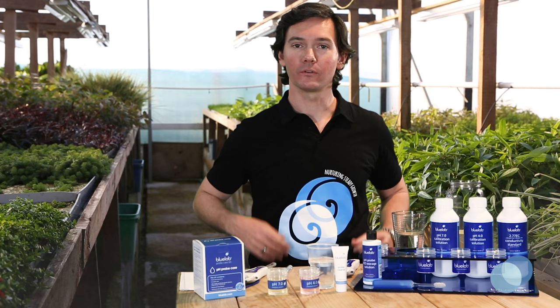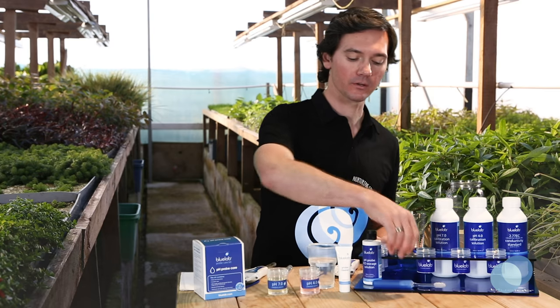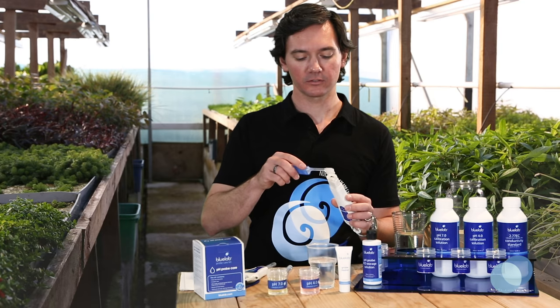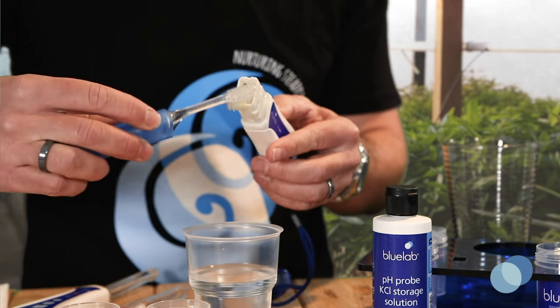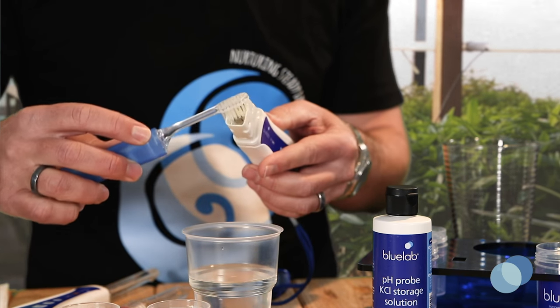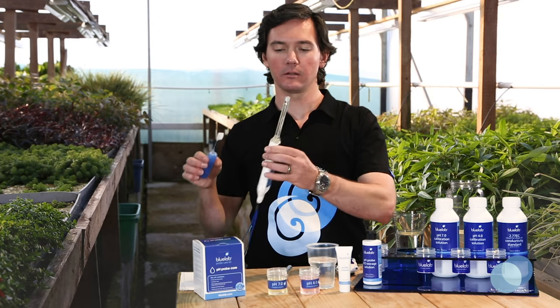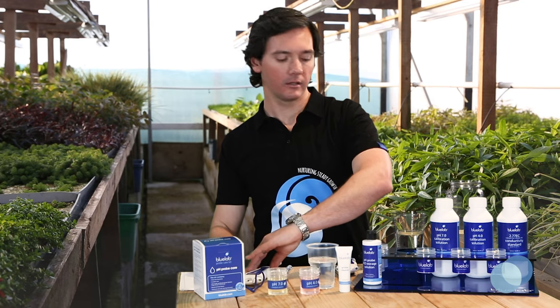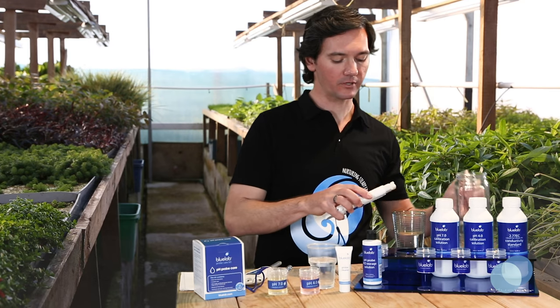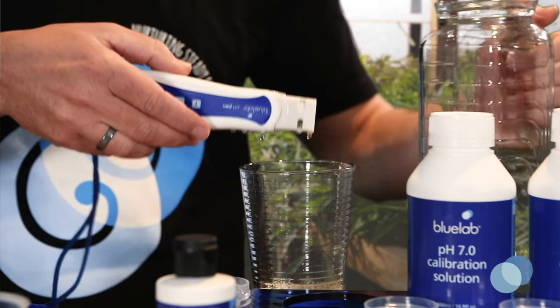If your probe requires removal of heavy contamination, use a few drops of Bluelab pH probe cleaner and a soft bristled toothbrush to gently scrub around the probe tip. For the standard pH pen, simply scrub around the glass probe inside the plastic. For the soil pH pen, scrub around the end of the probe stem. Then, clean the probe tip in some fresh clean tap water. Make sure you remove all traces of the cleaning solution.